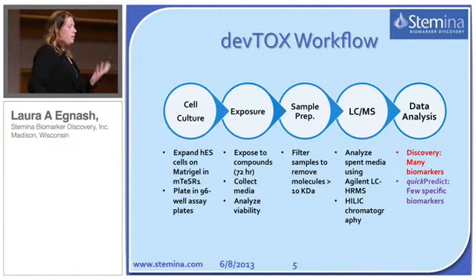Sample prep, we focus on small molecules, not the large, so we filter the samples to remove the large molecules. And then we use our LCMS-based platform to analyze the spent media, and our platform is based on Agilent QTOFs and TOFs and HILIC chromatography. The data analysis is where, well, part of where the two assays diverge.